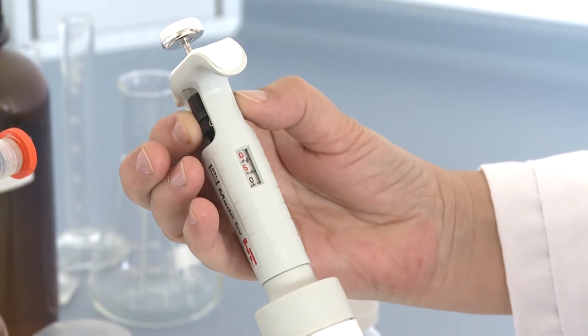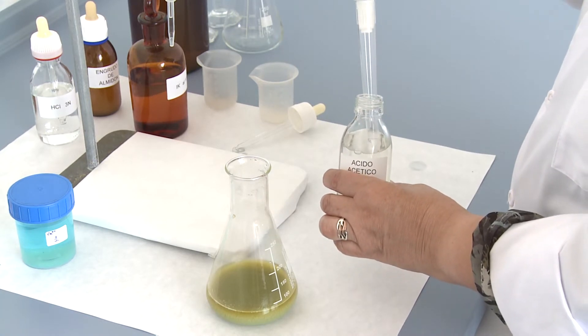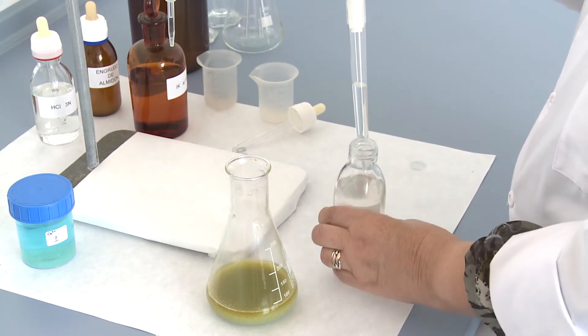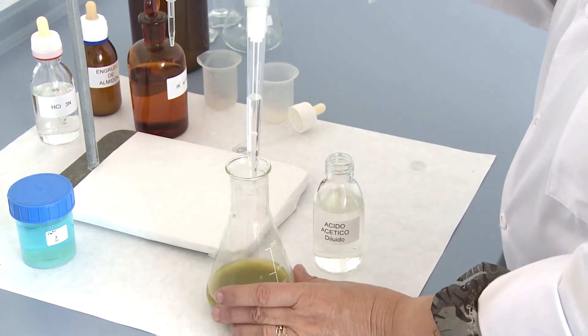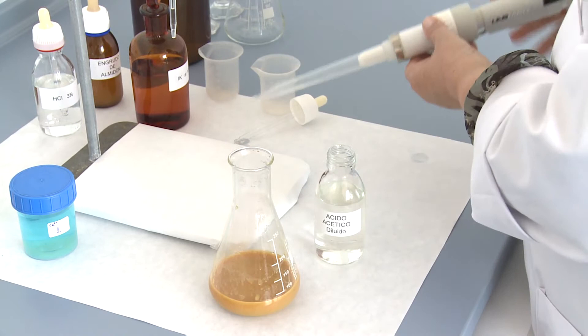It is then all diluted to about 50ml and then we start to titrate the free iodine with a solution of sodium thiosulfate until the solution takes a yellowish color.